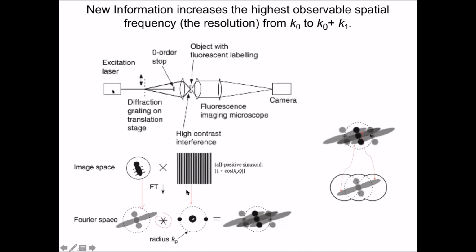If you look at a direct image of this, you see that it's a grating. In Fourier space, this is what it looks like. There are two dots in a central maximum, okay? And this convolution looks something like this, okay? What does that mean? If you go out in frequency space, you see that as a result of the convolution, you are actually increasing that frequency space.